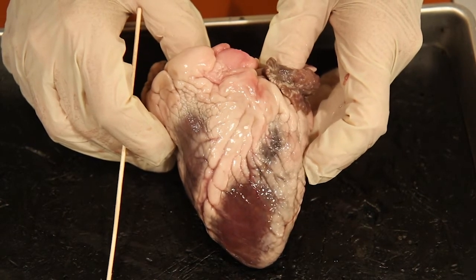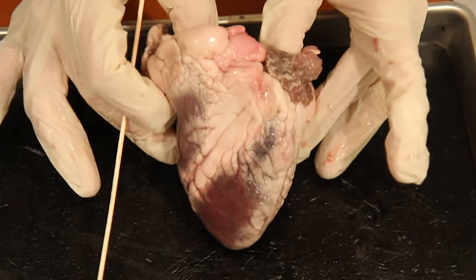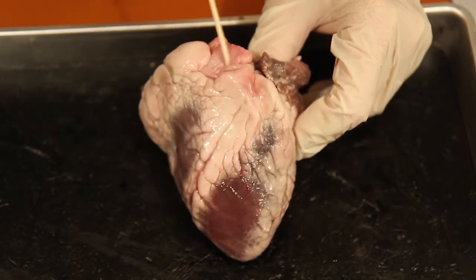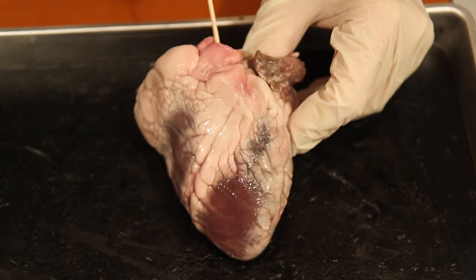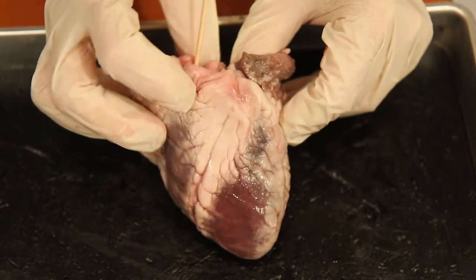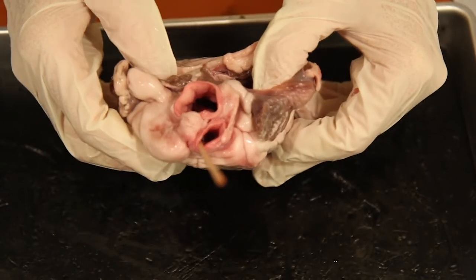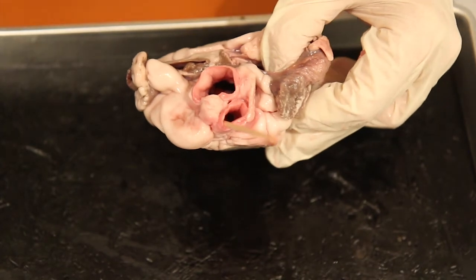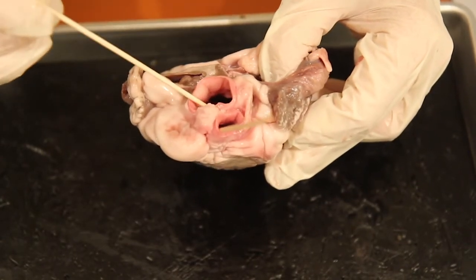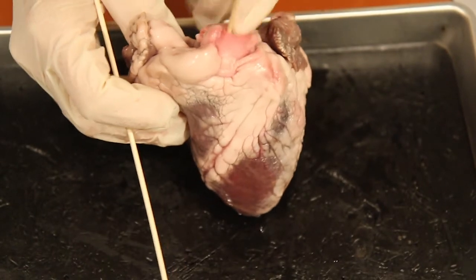On number four, it says place the heart in the anatomical position and locate the pulmonary trunk. The trick here is that the vessel that is most anterior — the one you can really see in the anterior part of the heart — is going to be the pulmonary trunk. I have my stick in a vessel and I'm going to rotate this so you can see. There you have the most anterior vessel: it's going to be the pulmonary trunk.